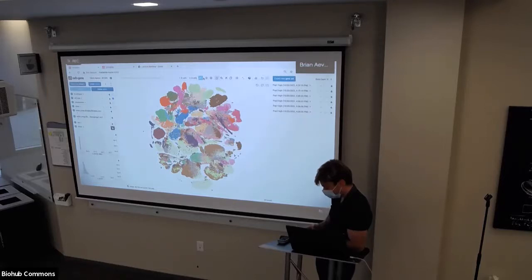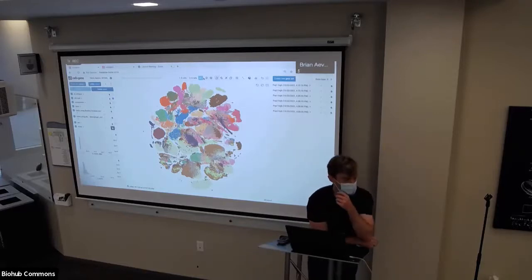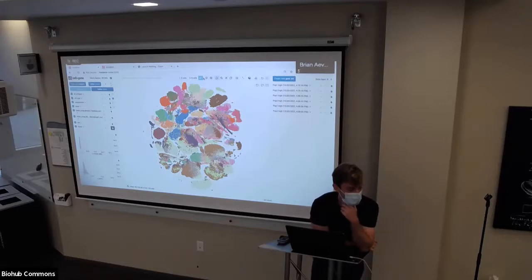Hey, Alec. Great work. This is a lot of really useful tools for analysis. I was wondering, for all the methods that you implemented, like clustering, batch correction, and so on, the default parameters that you have here, are those the defaults suggested by the corresponding tutorials? Are those parameters that you think are best for people? And is your recommendation that people just stick to those?